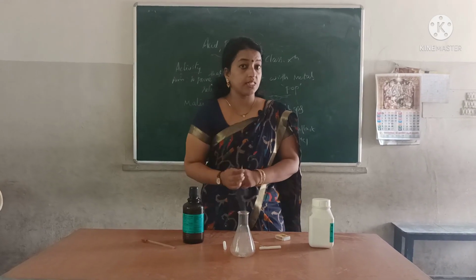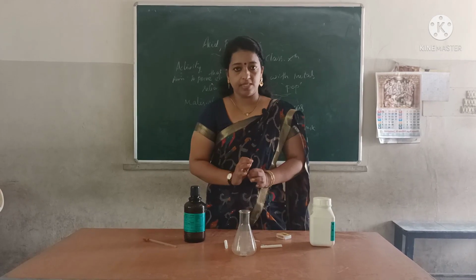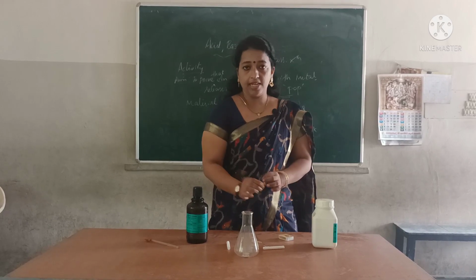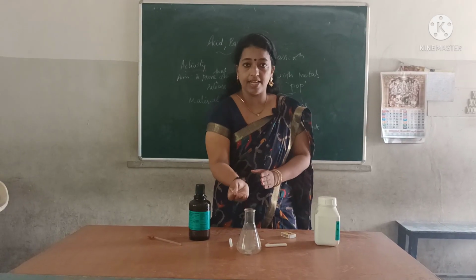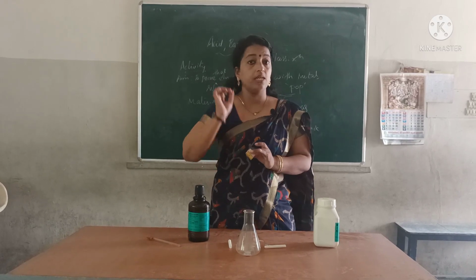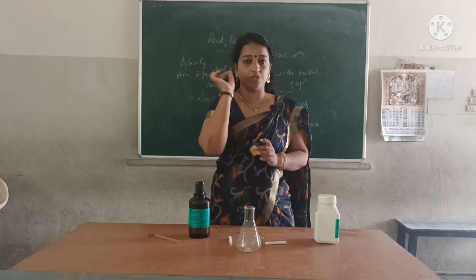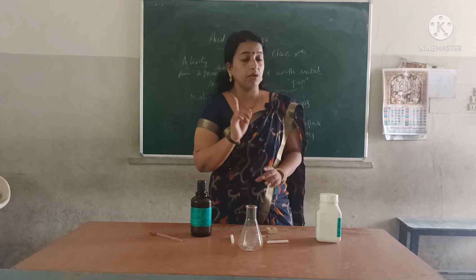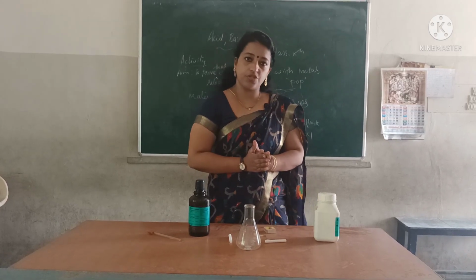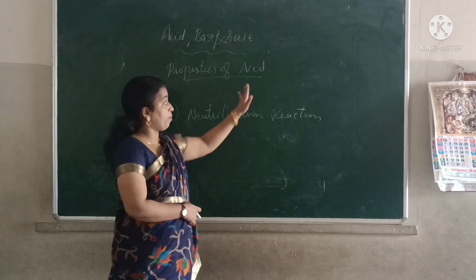Like that, we have to test the gas. Understood the activity? Take a conical flask, pour some HCl, add some zinc granules, and the reaction happens and the gases are releasing out. Then show one burning matchstick to the mouth of the conical flask. The burning matchstick puts off with the pop sound. Then we can prove that the gas coming out is hydrogen gas. Understood?